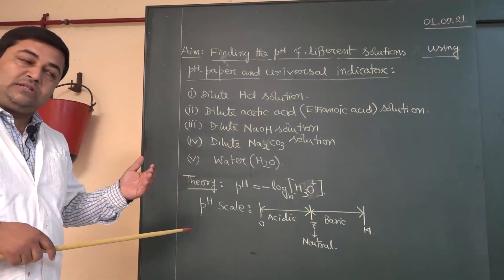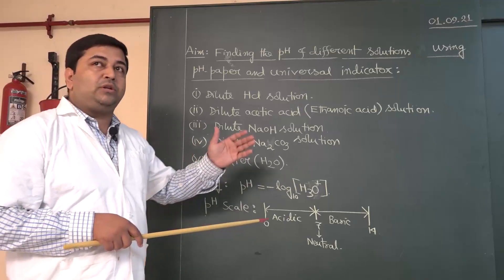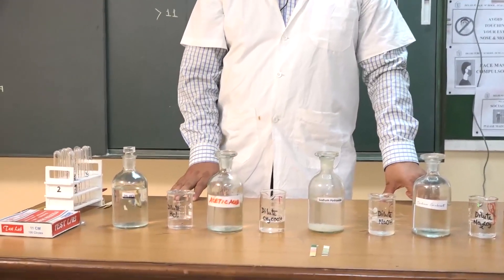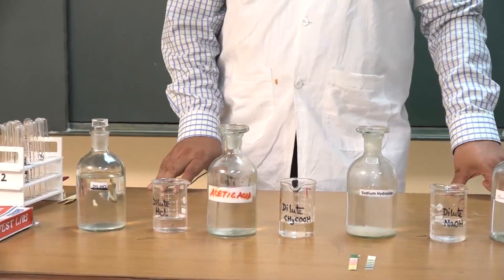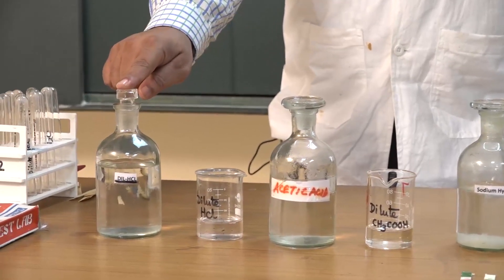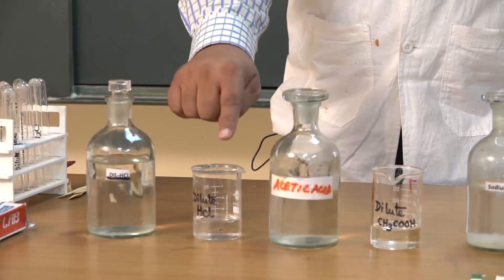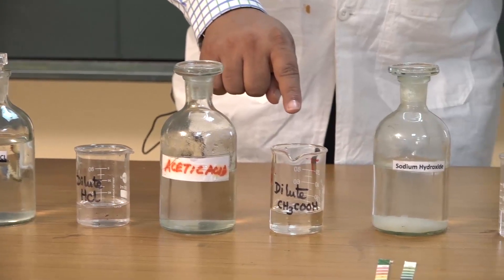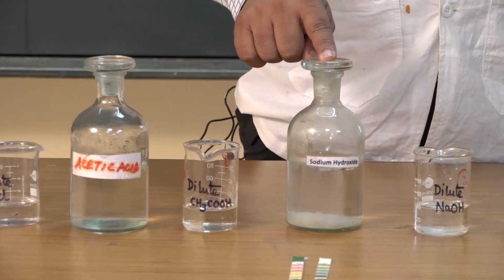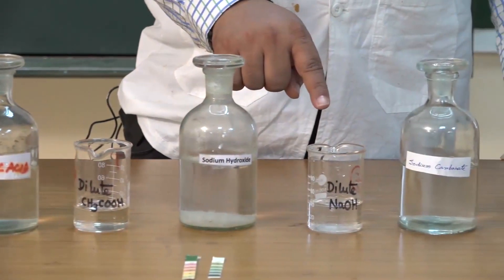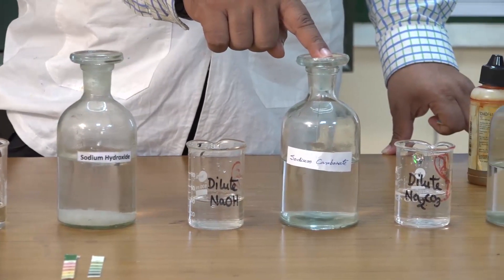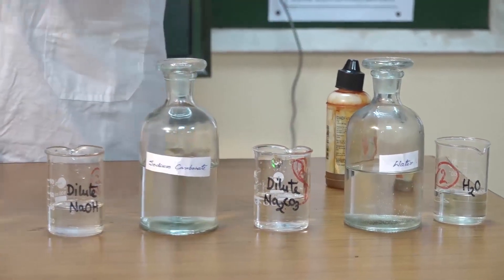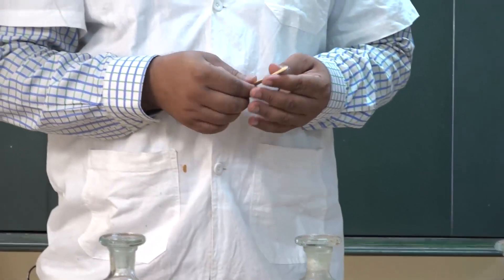Now we will come to the activity part — checking the pH of the following solutions and commenting on their nature. Here you can see different solutions in beakers: dilute hydrochloric acid, dilute acetic acid, dilute sodium hydroxide solution, dilute sodium carbonate solution, and water. Using pH paper we will now check the pH of each solution.